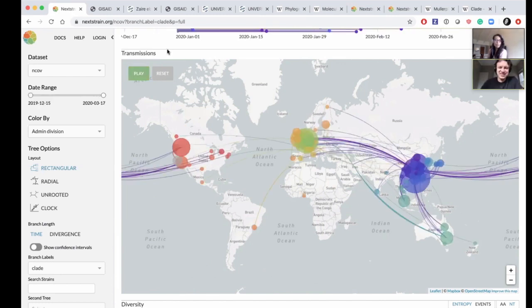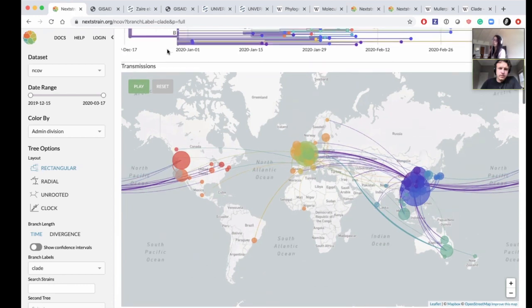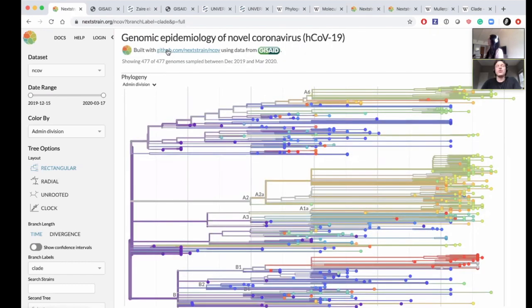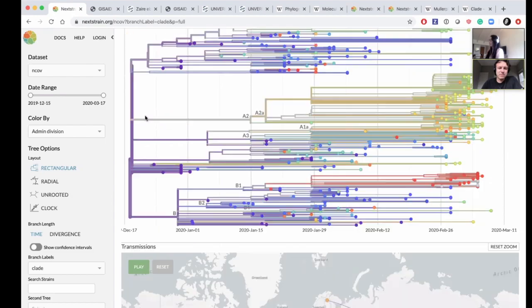Hydrosquall asks, what's an example use case for looking at two trees simultaneously? It came up in a PR review. Great question. I will have to defer that to the biologists. I don't understand that particular graphic. Okay. Good question though.